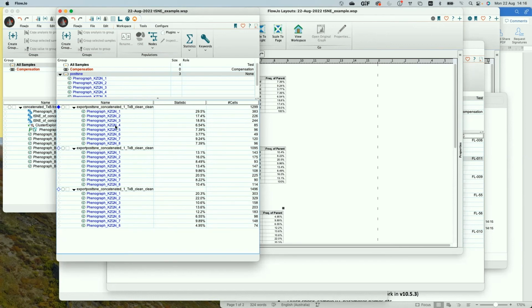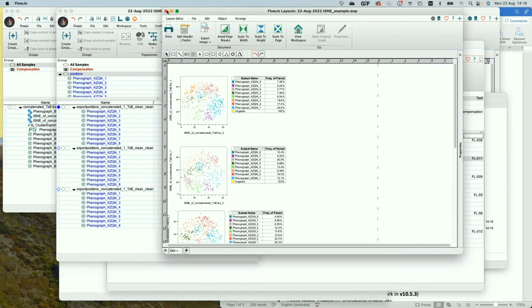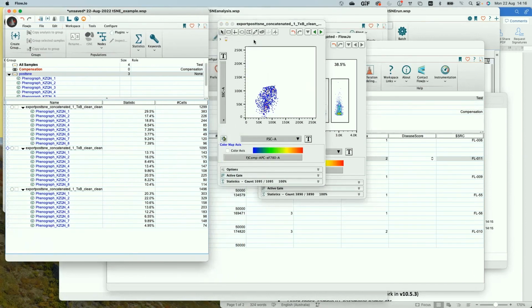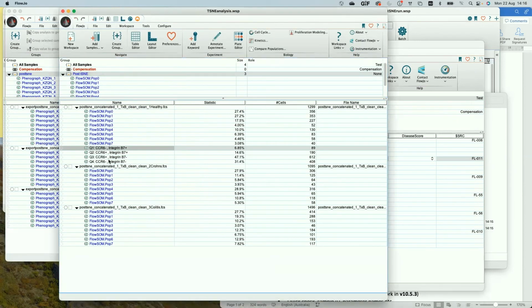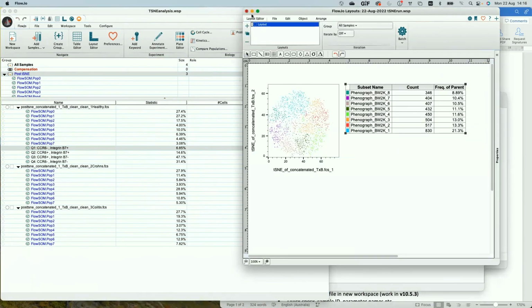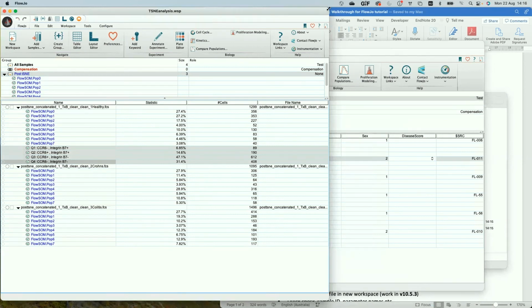Yeah, exactly. And then once I've done this and I've figured out that, for me, my CCR6 integrin beta 7 gate was the one that I was most interested in, that was the gate that I found of interest. That's then when I go back to my downsampled original populations, right? And I can actually just take that gate that I defined.